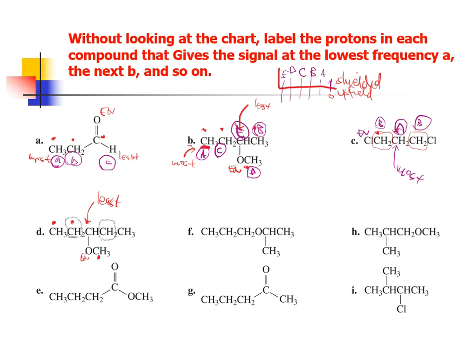So that means that the CH3 group on either end, either to the left or to the right, because they're equivalent, that particular CH3 group is going to be the most shielded out of the bunch. Again, what does that mean? That means that it has more electron density around those hydrogens. That electron density is not getting pulled through the molecule by the electronegative oxygen. You see what I'm doing?